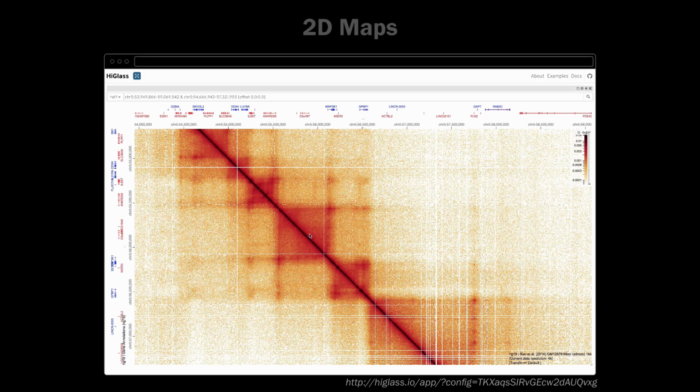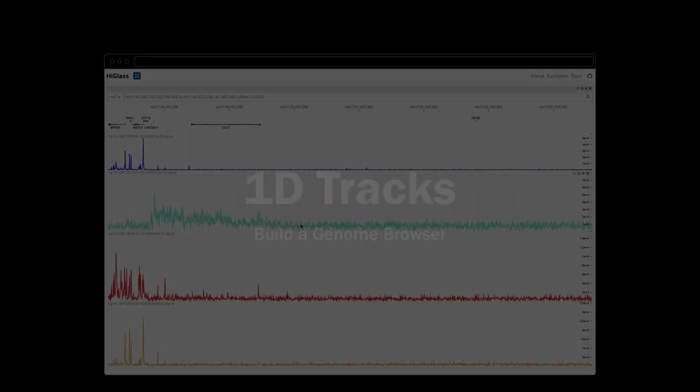Here we're currently looking at a window where we see a bunch of genes at the top. So this is chromosome 5, 54 million to 59. So there's about 5 million base pairs here at this point. And as you've seen, we can zoom and pan. That's a standard operation in these matrices.